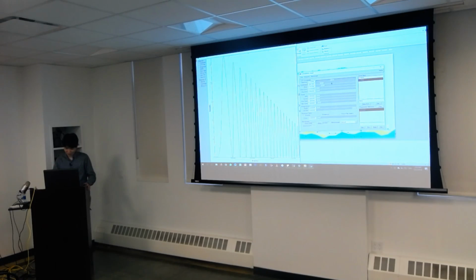Yeah, so this is what you see if you change the defocus. As Grant mentioned, on this axis is the intensity, the so-called contrast. And along the other axis is your reciprocal space, your spatial frequency. As you go along here, you get higher spatial frequency, and here lower. As I move my defocus value from a low value to a high defocus, you can see that you get many, many more oscillations of your CTF. So just be familiar with that: with a higher defocus, you get more oscillations.